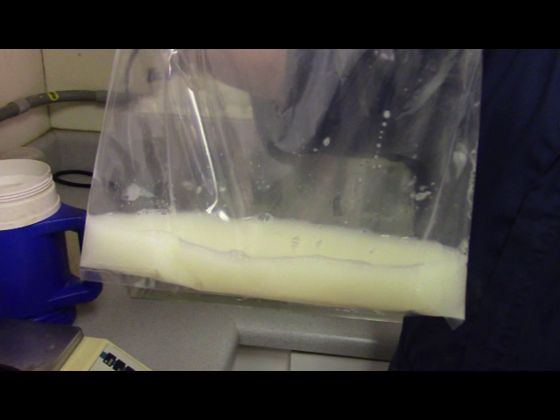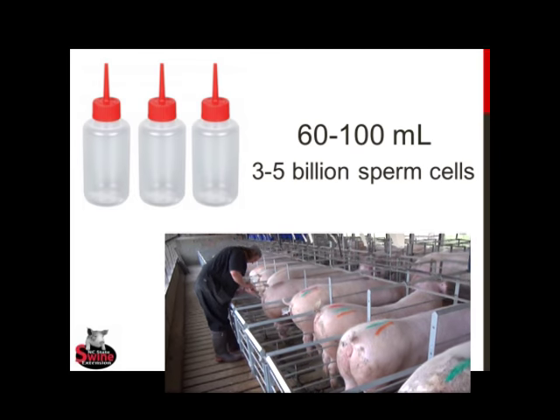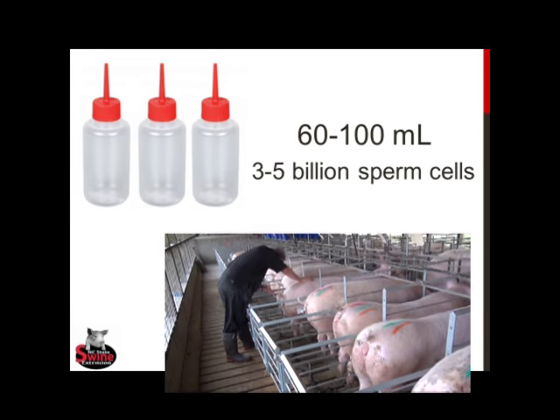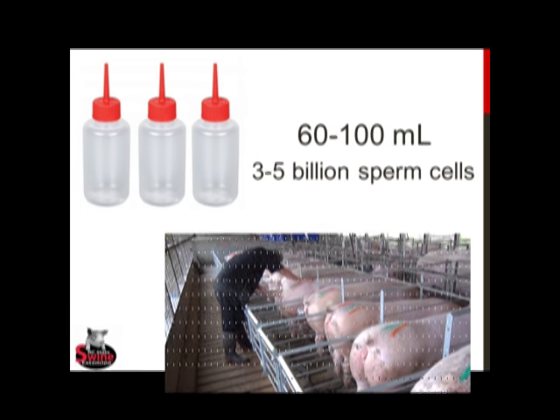Fresh semen must be extended within 10 to 15 minutes after collection to guarantee maximum quality and fertility. Our goal is to extend the semen into 60 to 100 milliliter doses, each containing 3 to 5 billion sperm cells. Research has shown that this semen volume and sperm number gives the best reproductive results when artificially inseminating. To get this right, we need to know the semen volume and the total sperm number.